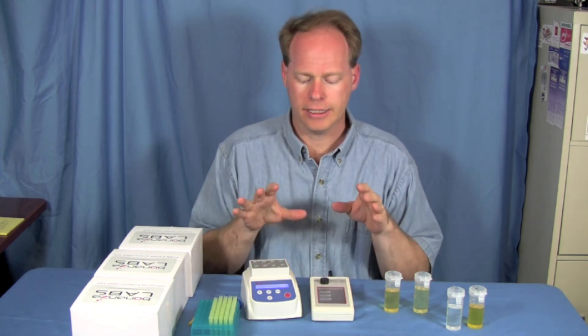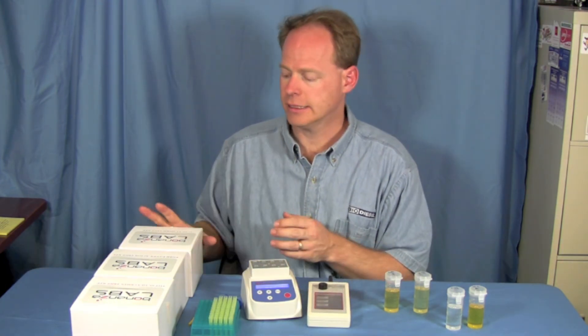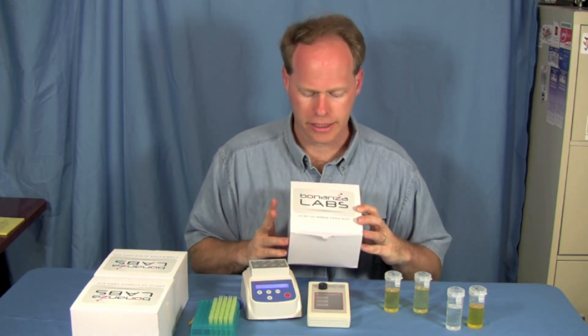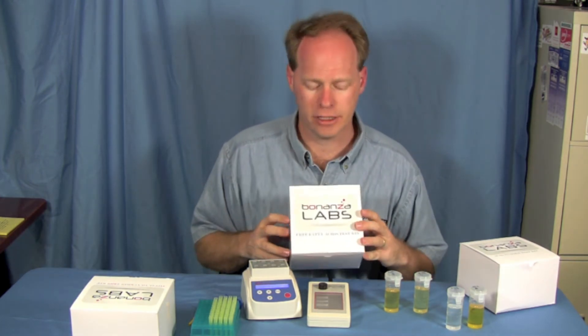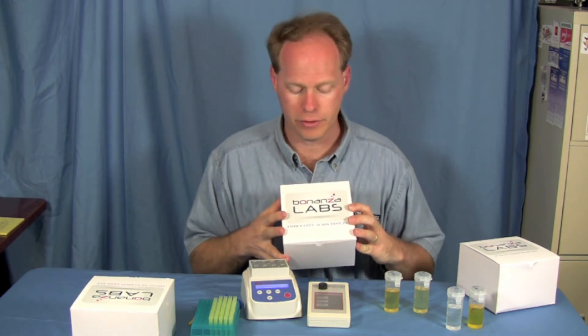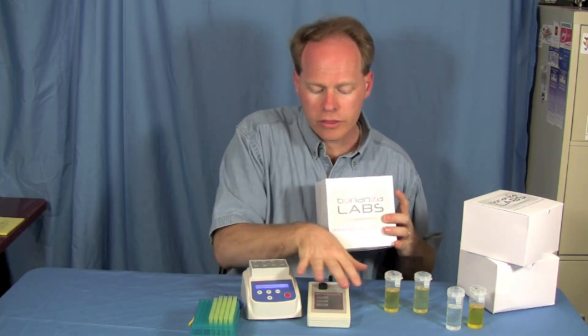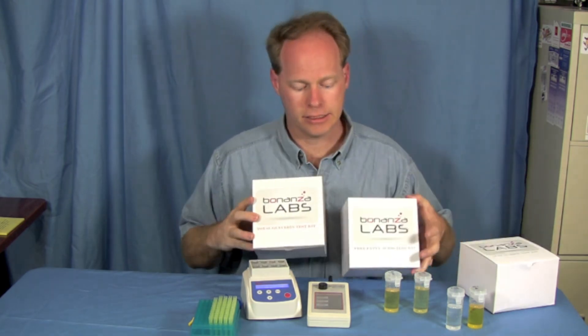The test package is available from our website at Utah Biodiesel Supply. It's supplied by Bonanza Labs and you can purchase these kits individually. This is an acid number kit. Each kit comes with ten tests available in it. The free fatty acid test and the total glycerin test. When you get this kit combined, it comes with all three of these as a starter kit.